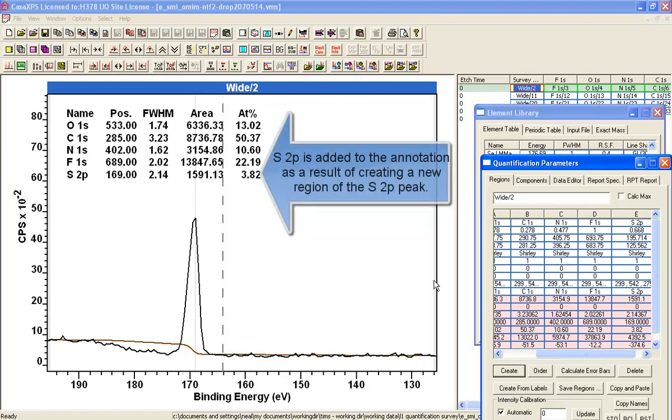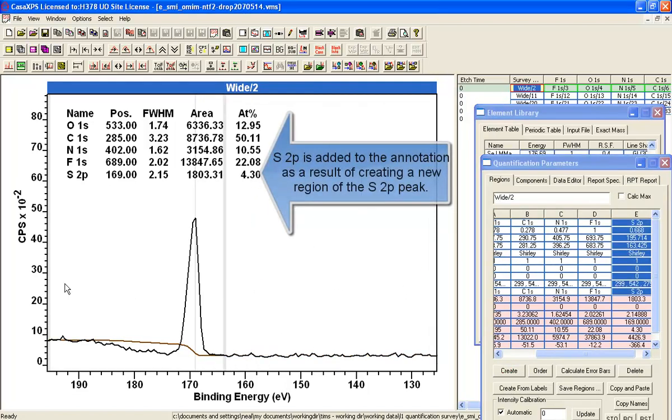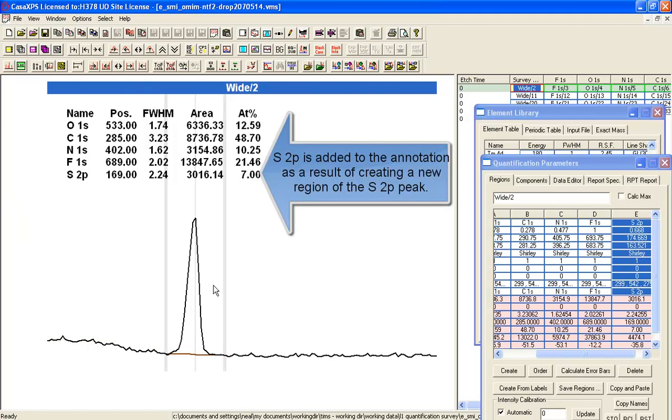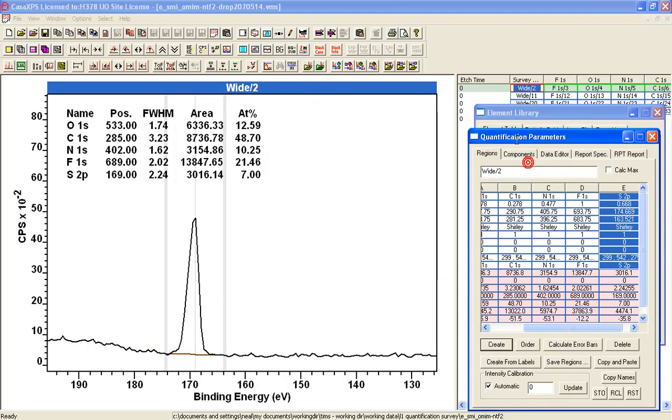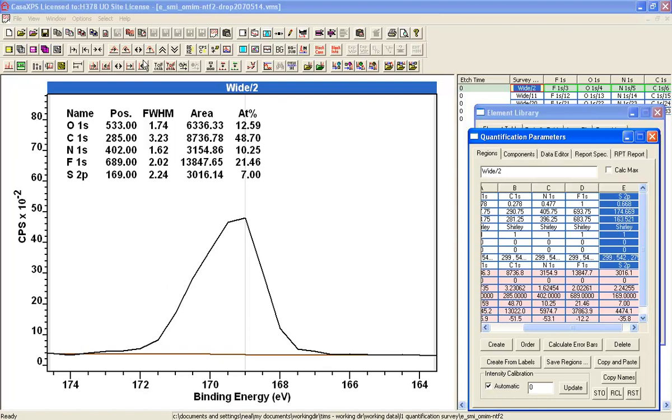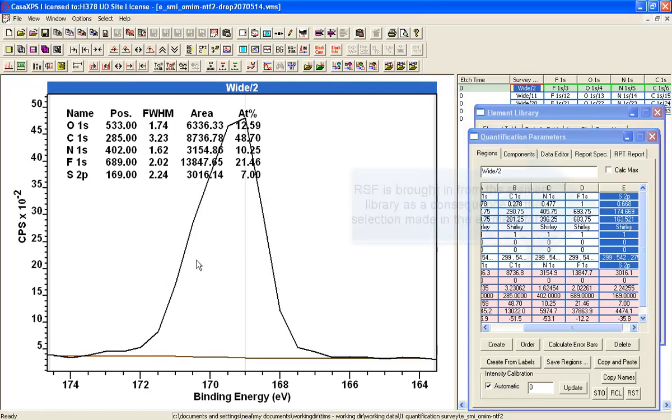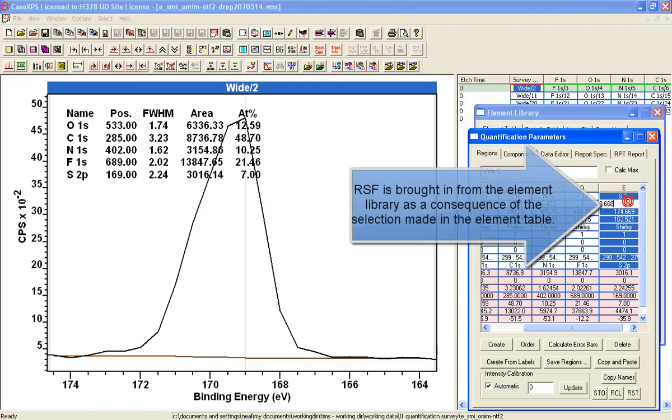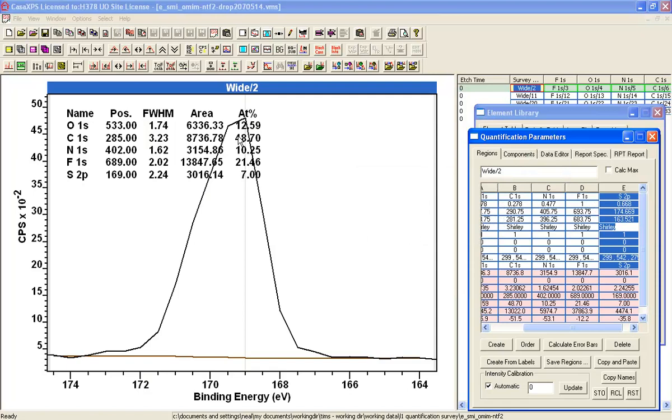We'll create a region and the region is based on the display limits. So I need to just adjust so that I've got a region that is the peak itself. And you'll see the sensitivity factor is the same. It's got a Shirley background. That was the last one used. And we now see that it's added to the table. And I've got a quantification based on the regions as created so far.